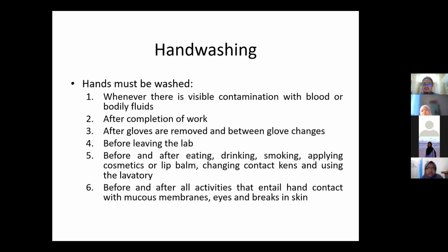After gloves are removed and between glove change, before leaving the lab, before and after eating, drinking, smoking, not that I recommend, but if you are a smoker, before smoking pun you must wash, before and after. Applying cosmetic and lip balm, changing contact lens, and using the toilets. Also before and after all activities that entail hand contact with mucous membranes, eyes, and breaks in skin, macam wound.